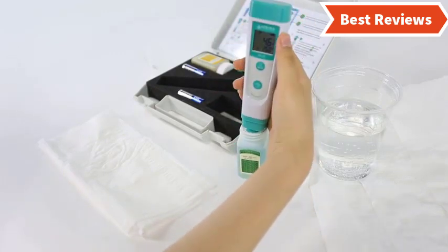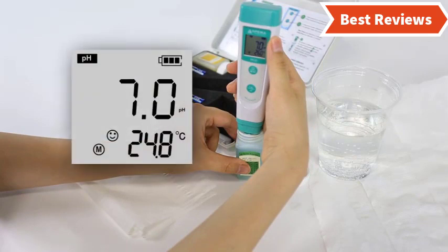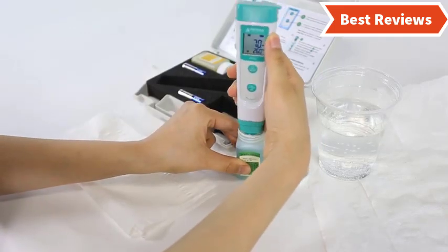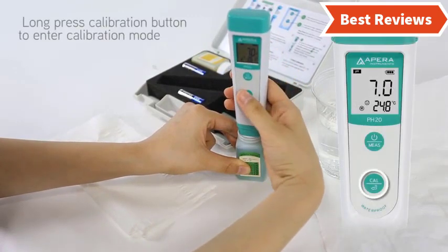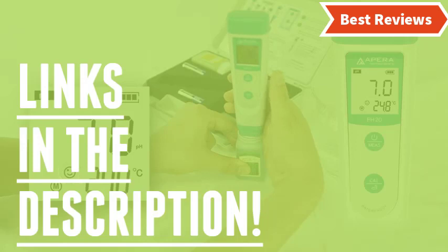Stay with the video till the last and make your decision on which one will be suitable for you. The pH meters come with variation in their design, quality, and price. We will show you pH meters from several brands — the items offer great versatile features and exceptional performance. You will also know why they are the best and what the features of a top quality pH meter are. Check the description for links to find out the price of the items included in this video.